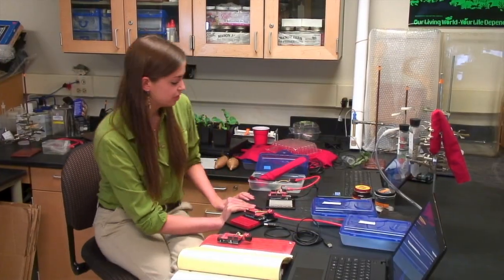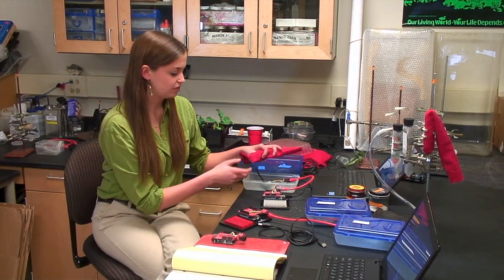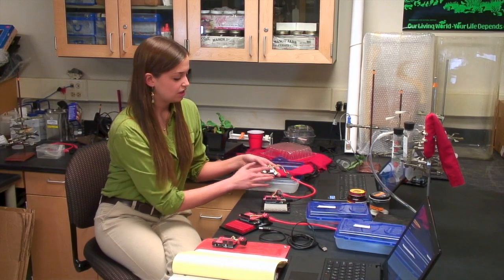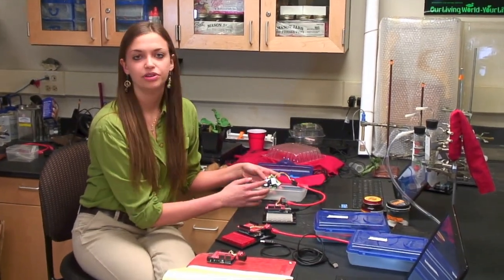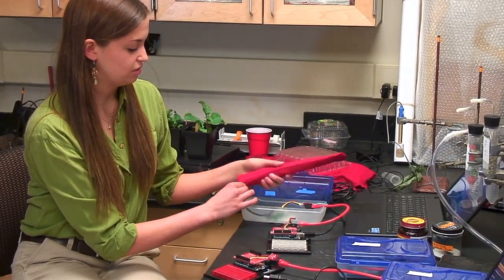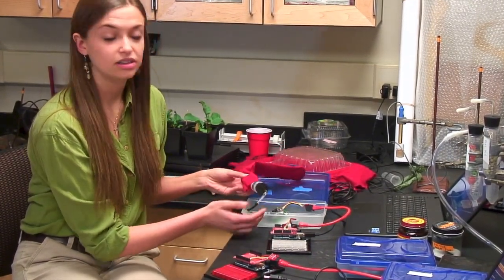We have this setup going on in here, again inside of our container. Within here we have the direct setup on top of the CO2 sensor, the same one we were using for the yeast. However, this time we have the direct connection going directly into our container with our peas.